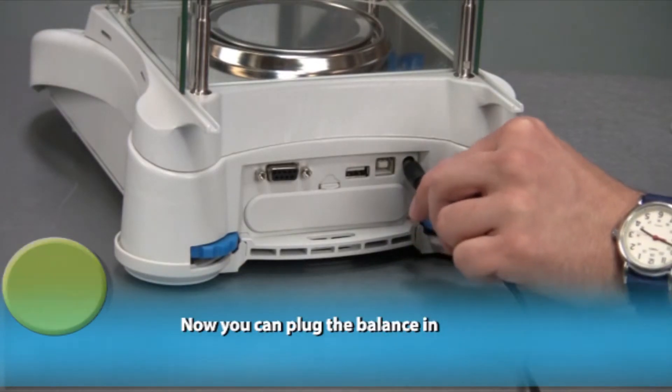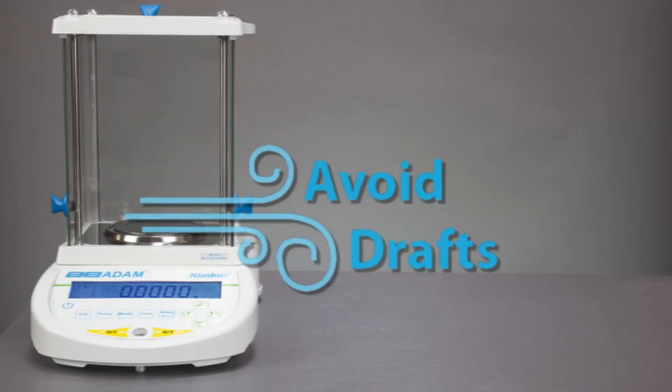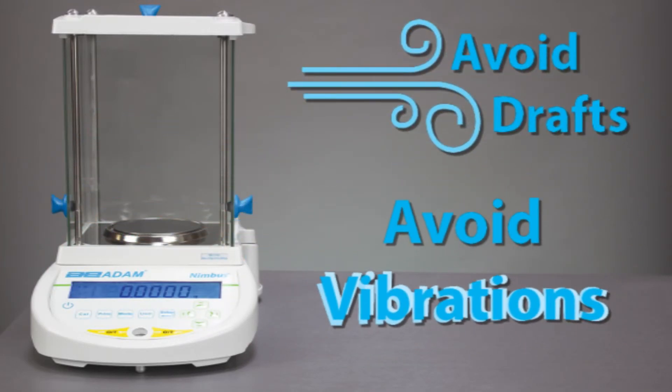Now you can plug the balance in. Avoid drafts and avoid vibrations.